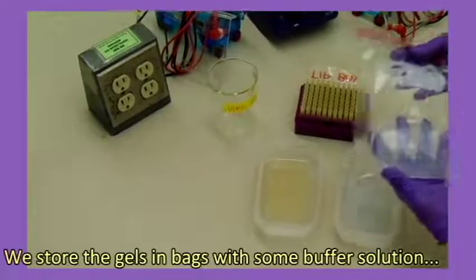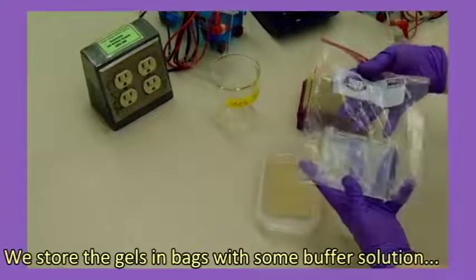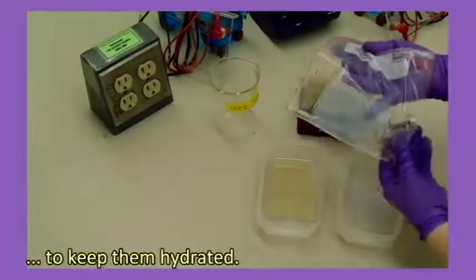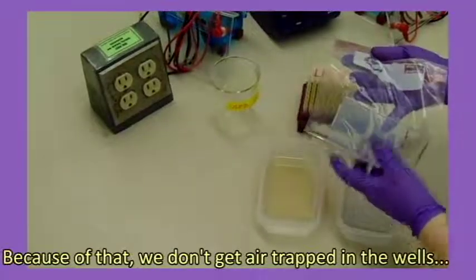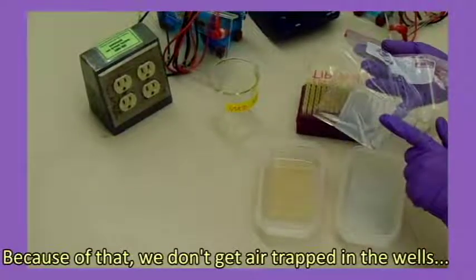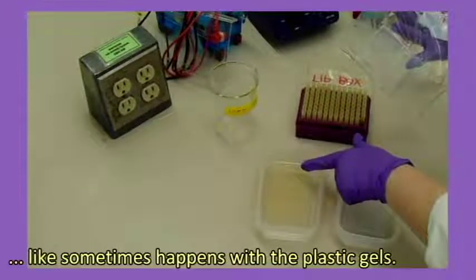We store the gels in bags with some buffer solution to keep them hydrated. Because of that, we don't get air trapped in the wells like sometimes happens with the plastic gels.